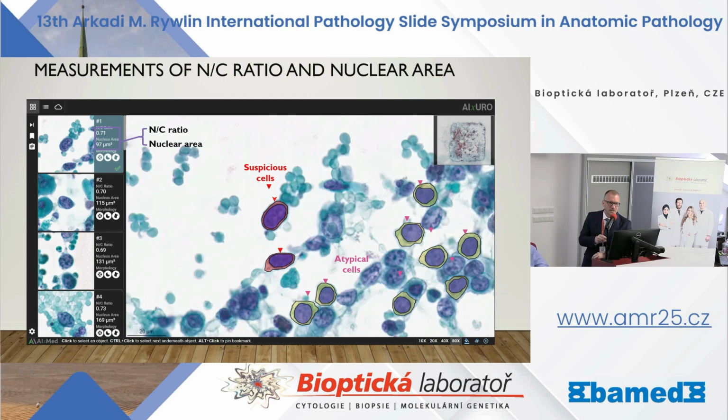Again, this is just a detection system, because you can get suspicious cells with completely benign cases. You can get low-grade cells with a little bit more high-grade. You can get high-grade almost without atypia in urine. So you have to think, you have to see what's on the background, you have to think if it's just a spontaneous urine or bladder washing with atypia, reactive atypia, and so on.